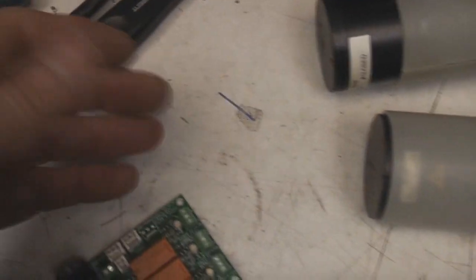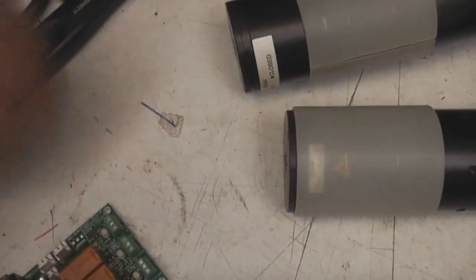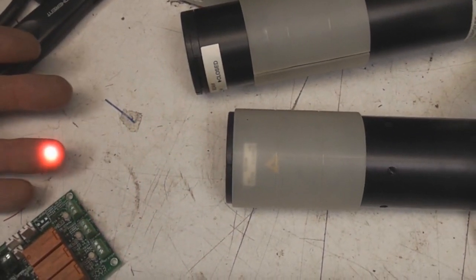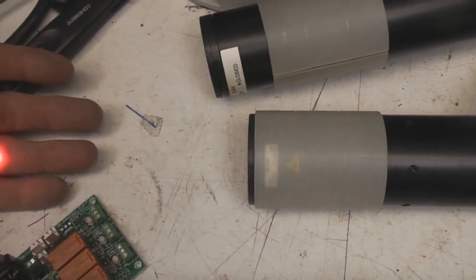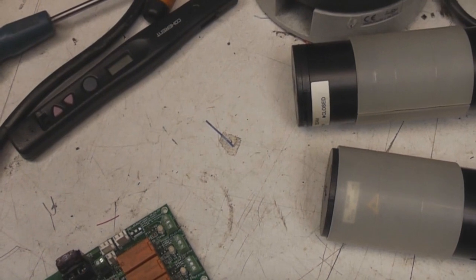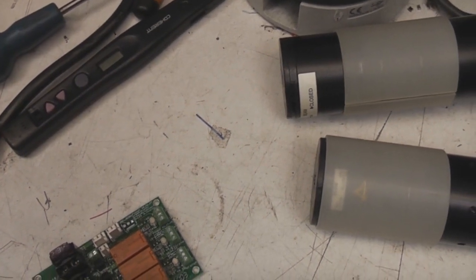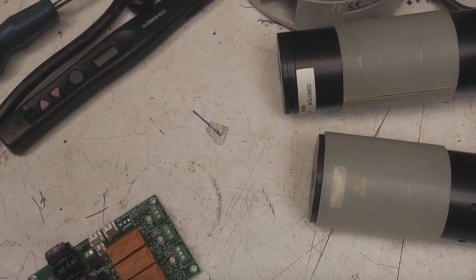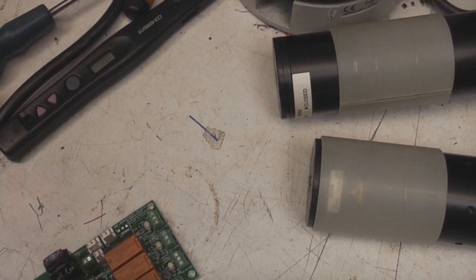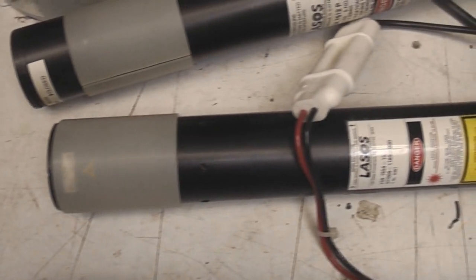And so the red helium neon works quite happily. It puts out about 23 milliwatts. So this is quite long as helium neons go. But I mean, helium neons are fairly obsolete these days because obviously a lot of the applications have been replaced by diodes. They do have some advantages. They do have very nice beam quality. You get sort of very nice low divergence beam and a very stable wavelength at 632.8 nanometers, which is often used as a wavelength reference.